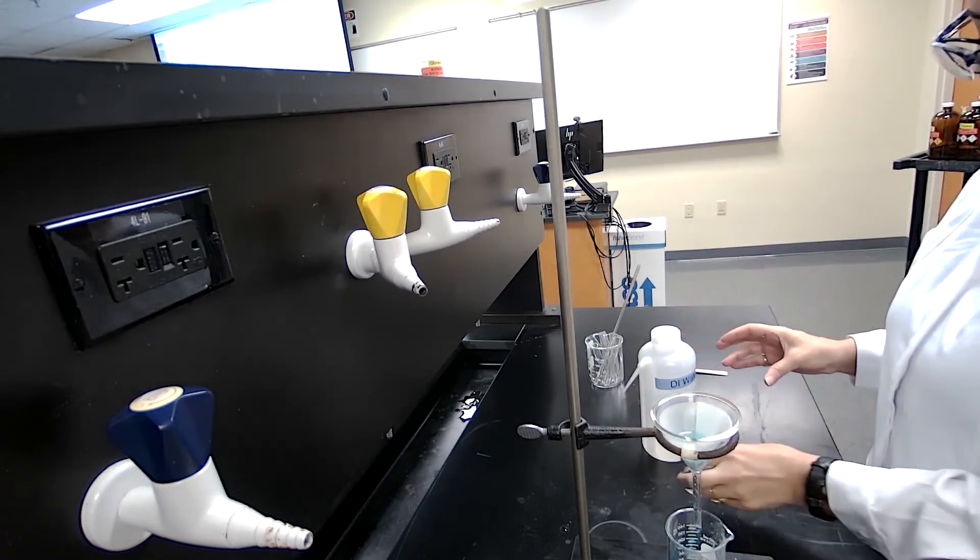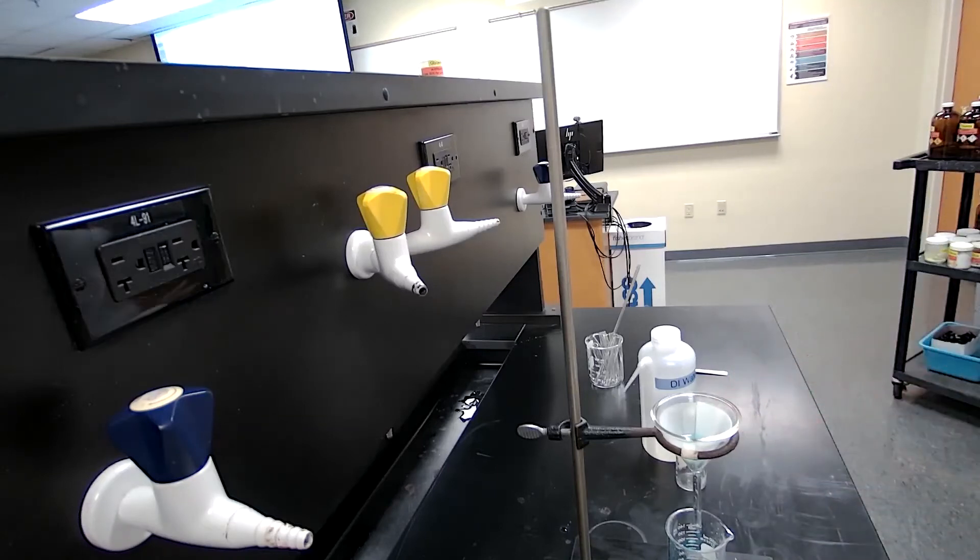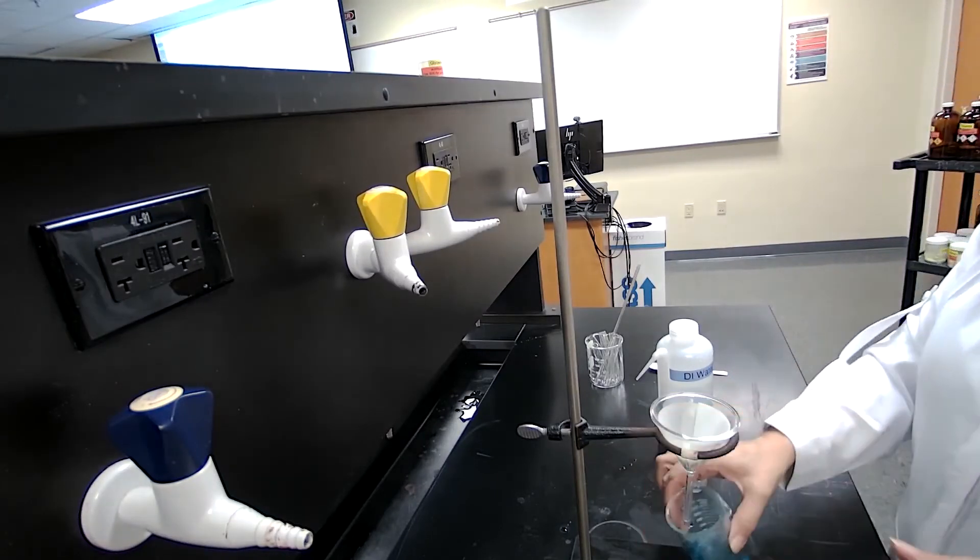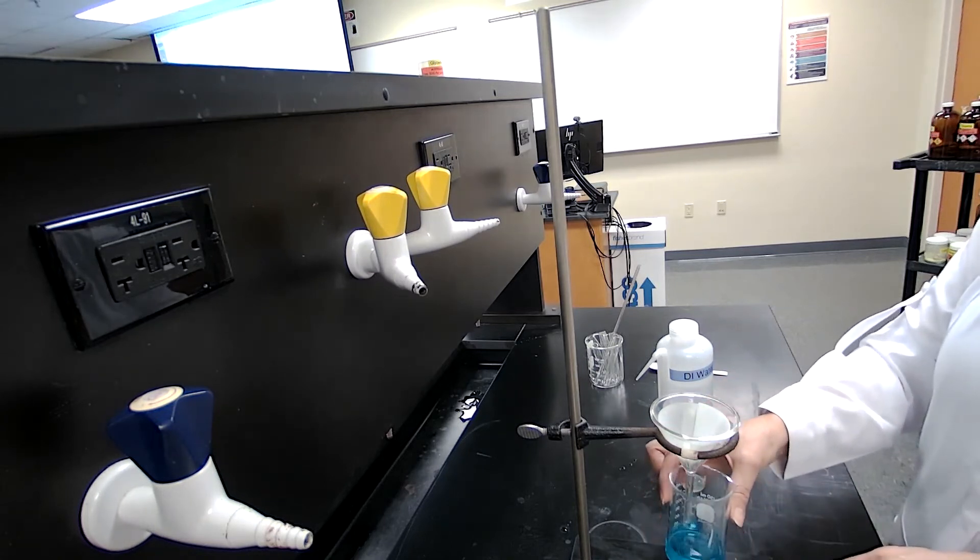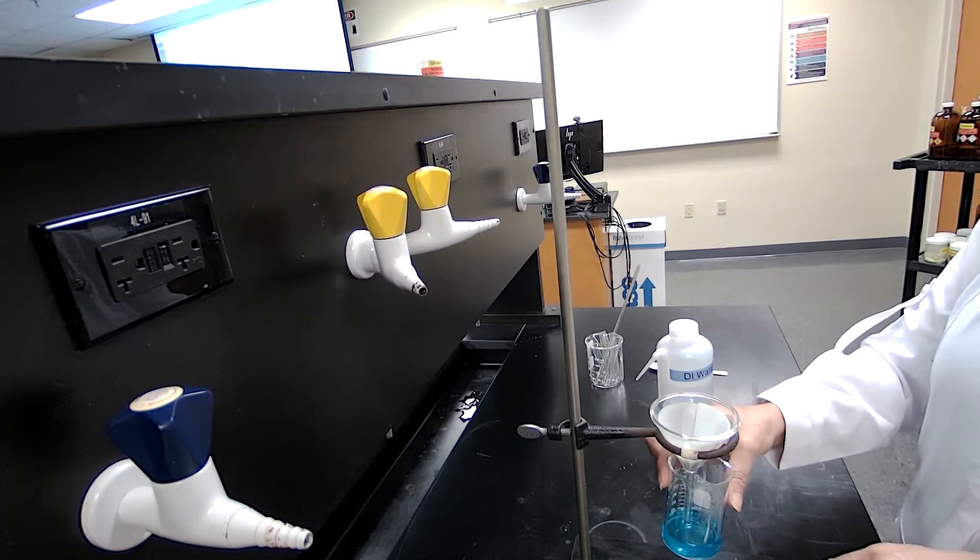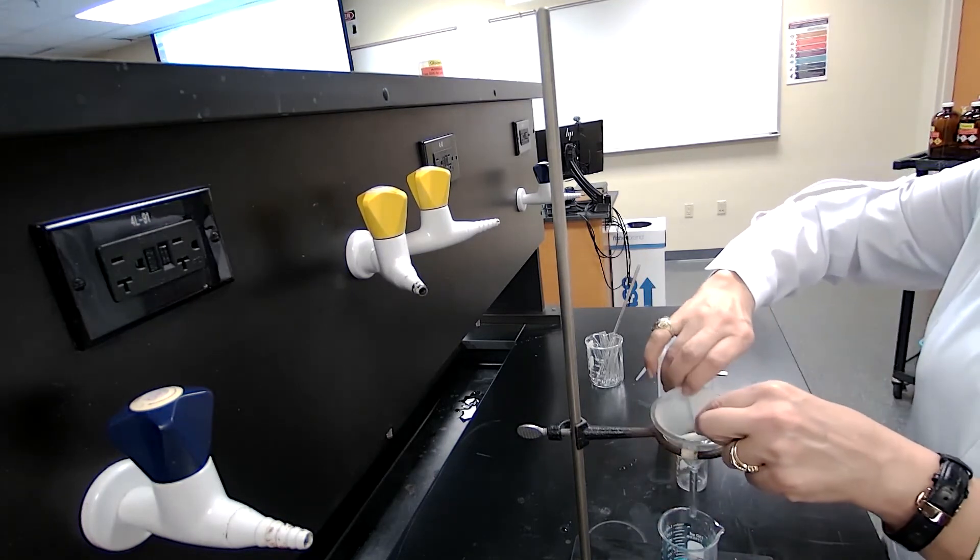Now, with this, we have separated the solid from the liquid. The liquid portion is now in the beaker. We have a solution of copper sulfate - it's a blue color solution in the beaker. And the sand is on the filter paper.